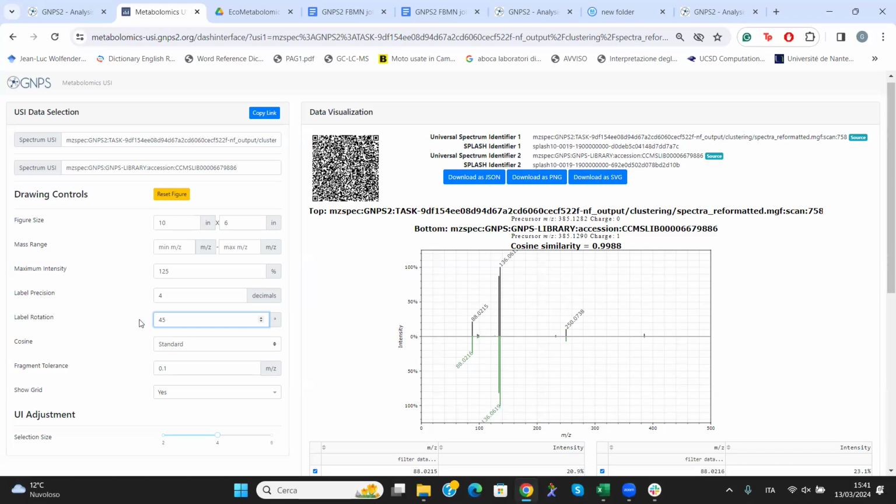in these days for sure. But another important thing that we see here is the USI, Universal Spectrum Identifier. This is really important because when you have the USI of your molecule, you can do many searches in the different tools. It will be required if you keep following and keep using GNPS in many other workflows. So when we speak about USI, it is this code that you can access in this way. And let me see other important things.